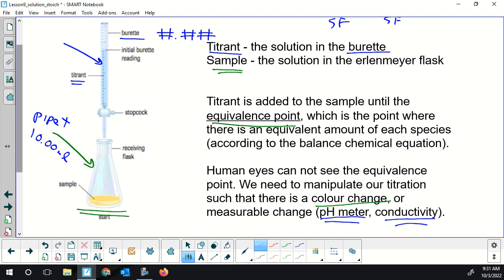You could spill something, again, contamination. Putting the wrong chemical in, there's lots of sort of systematic errors you can do. And sometimes they're more subtle than these sort of big examples that I'm mentioning. Pipettes are great for this repeated trial, because if you fill these right to the line, you've got this nice 10.00 mils every time. Nice quick repeats. Same math is being repeated through every trial because you have the exact same volume. Graduated cylinders do not give you that repeated volume every time.